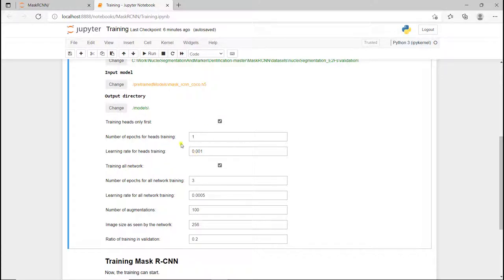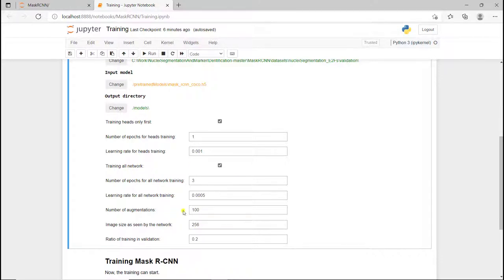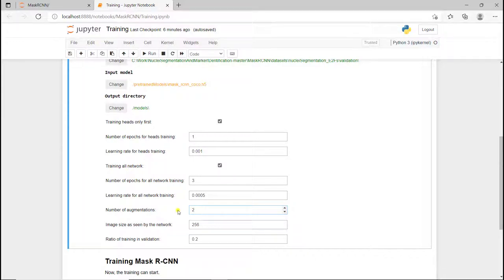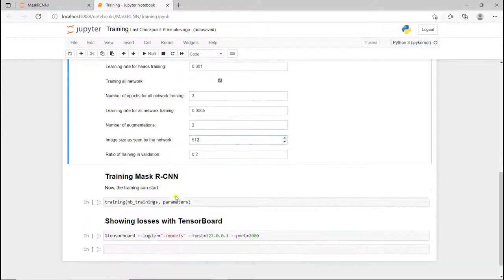You can define the number of epochs and the learning rate for the heads, the number of epochs and the training and the learning rate for the whole network. I'm going to keep those values, but I'm going to change the number of augmentations because it's going to be very long otherwise. Here is just for demonstration, so I'm going to put it to 2. The image size here needs to be increased to 512 to have the actual image size.